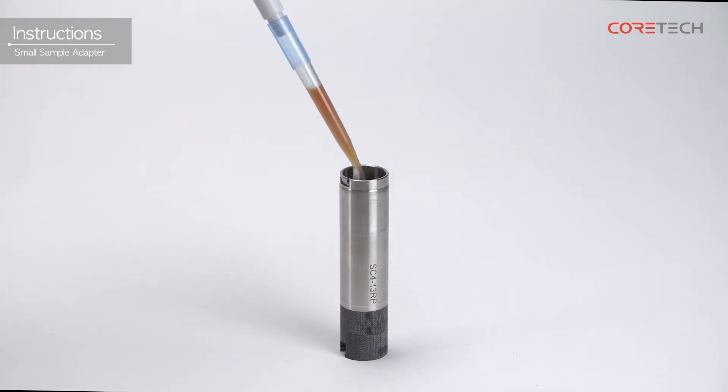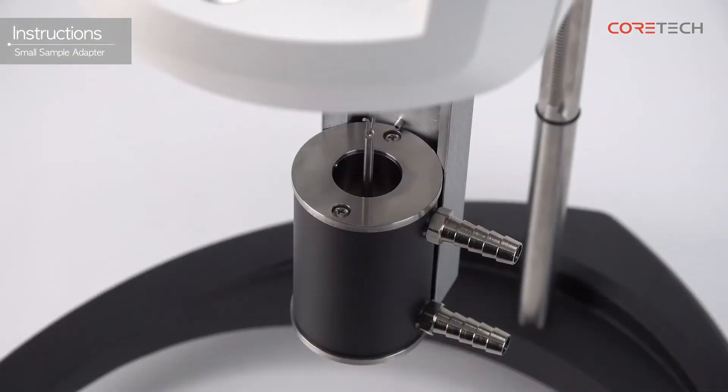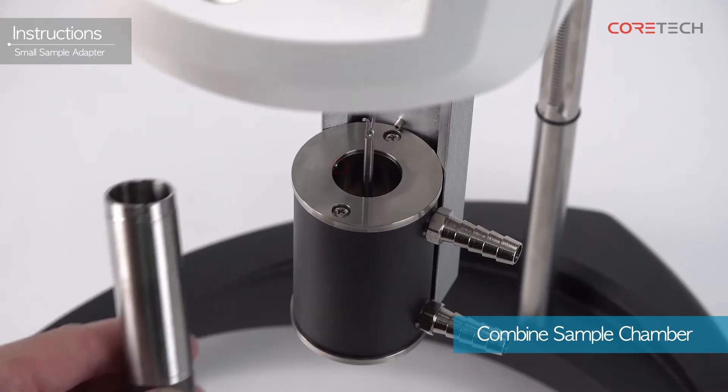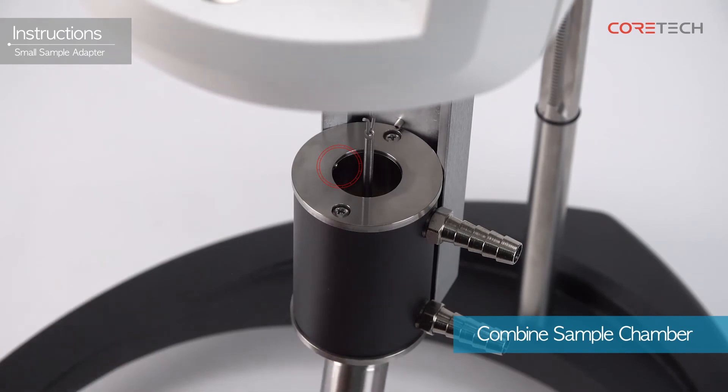Put the sample in the sample chamber according to the sample quantity of the selected model. Attach the sample chamber containing the sample to the water jacket. Combine the sample chamber from bottom to top in line with the groove in the water jacket.